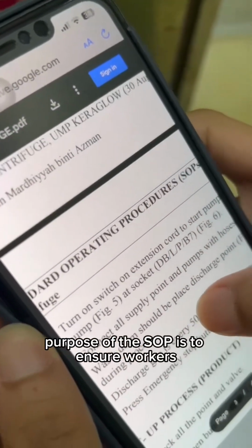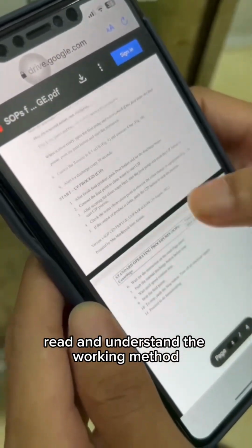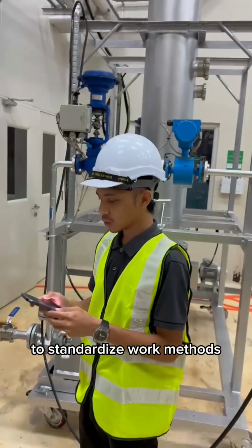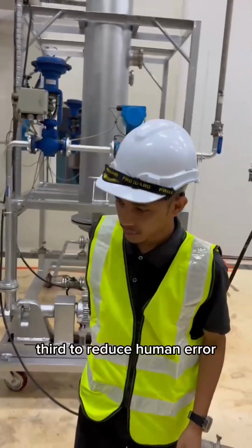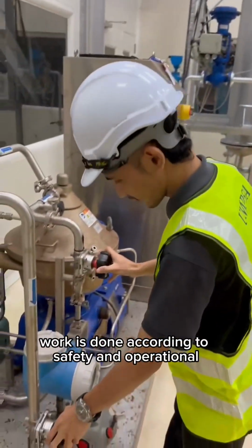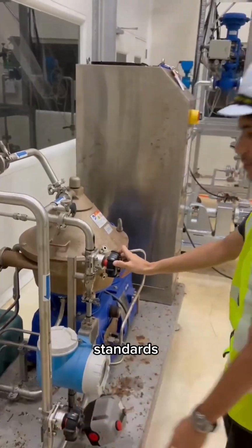The purpose of the SOP is, first, to ensure workers read and understand the working method before starting work. Next, to standardize work methods for safe and correct operation. Third, to reduce human error. Fourth, to ensure work is done according to safety and operational standards.